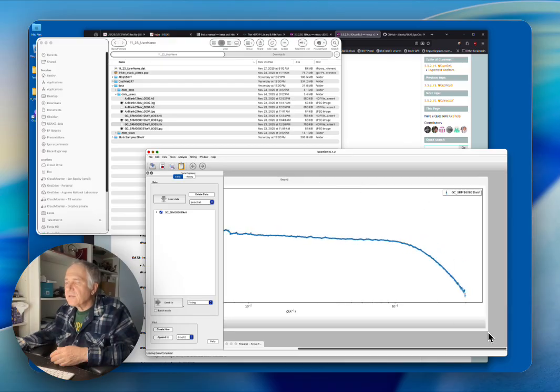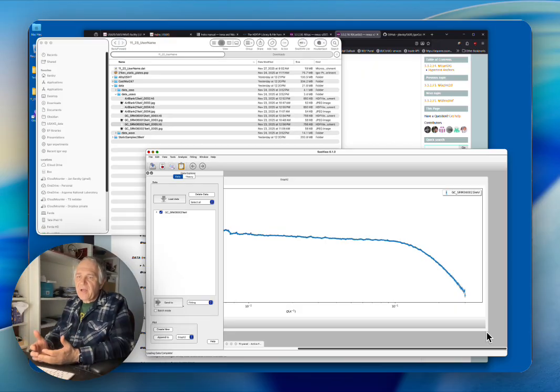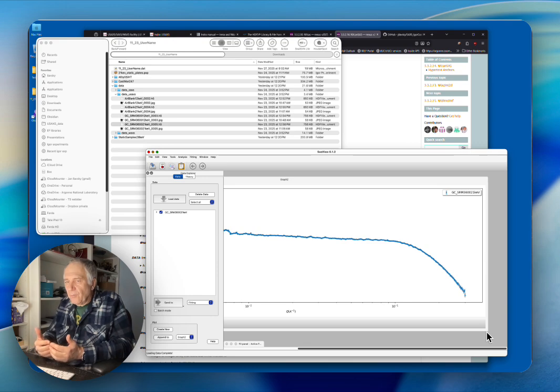So without any data reduction at all, your USAXS is already reduced. That has been done by the automatic data reduction routine. If the standard parameters are fine for what you want from the instrument, and you don't need to do any changes, the data provided directly, without any further data reduction, contain calibrated, desmeared, and corrected data. They're just ready-to-go data inside each file, which are written according to the standard.